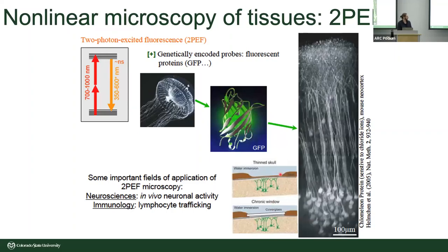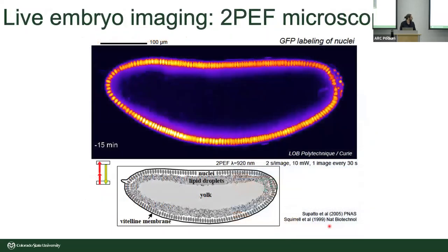As the technology has developed and longer wavelength sources and high-powered sources have become available, we've also developed the preparations a little bit, to the point where we can now thin the skull, and you can still reliably image through roughly 700-800 microns worth of depth at still full diffraction-limited resolution, which is about 1 micron, maybe 800 nanometers or so, all the way below the tissue, imaging through the mouse skull. So this is just one application space.